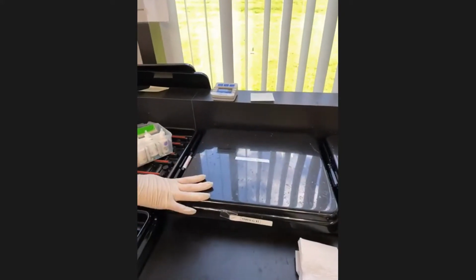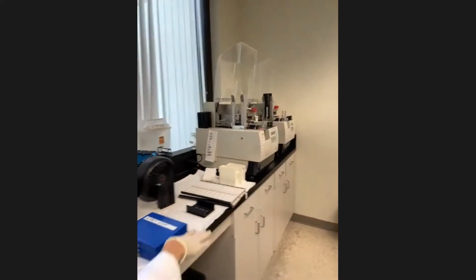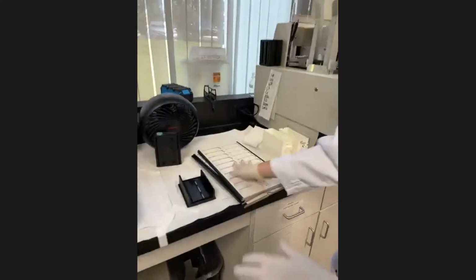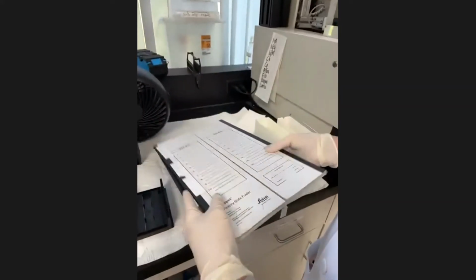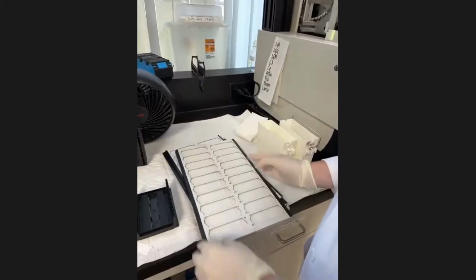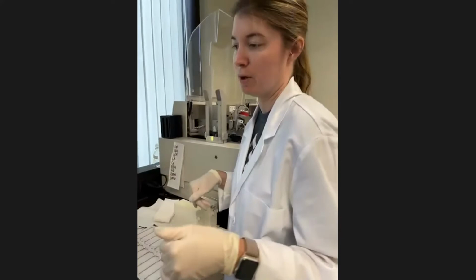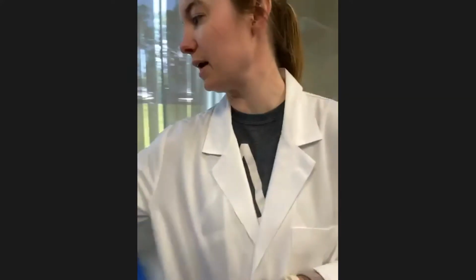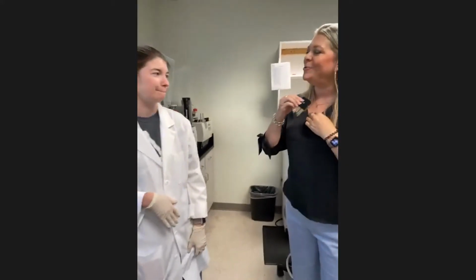And then when the 30 minutes is up, we put them over here on the aqueous cover slipper, and they cover slip, and then they dry, and then they go into these cardboard folders. And the reason why they go into these folders is because the IF slides are light sensitive, so this keeps them contained from the light so they don't lose positivity before they go over to the doctors. And everything that we do over here is hand stain. It's all 30 minutes. And the only thing that we put on the covers of the stainer is the H&E slides, which are here, and they go on one of the thermo stainers that Denise has already showed y'all over there.